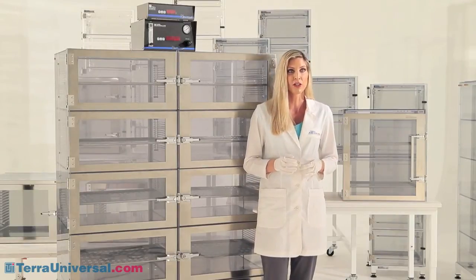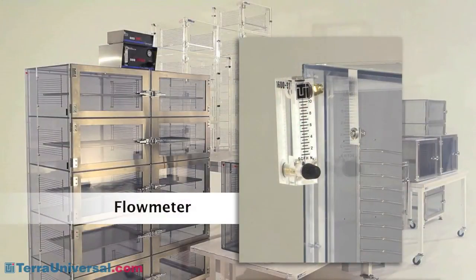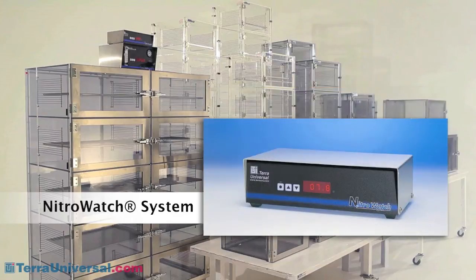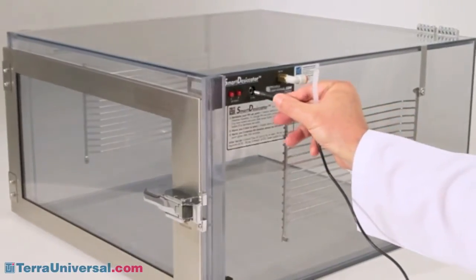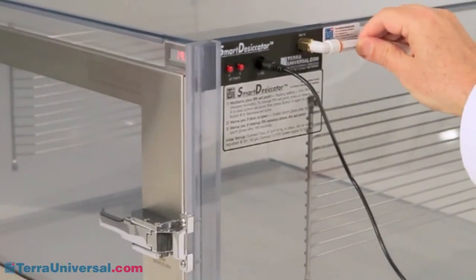Adjust-a-shelf desiccators allow a number of nitrogen control options to meet various humidity requirements. A flow meter provides inexpensive gas control and is appropriate for use in small cabinets. A dual purge system delivers a variable nitrogen purge — when doors are closed it restricts flow to conserve gas, but when a door opens it switches to high flow to remove moisture quickly and efficiently. A nitro watch controller adds humidity sensing and RH control capabilities, allowing you to maintain a humidity set point automatically. Terra's smart desiccators incorporate these humidity controls into a turnkey benchtop chamber that's easy to set up and program for your humidity requirements.